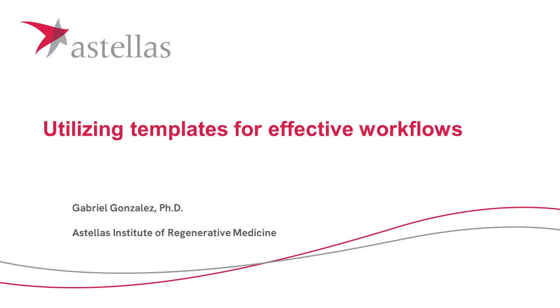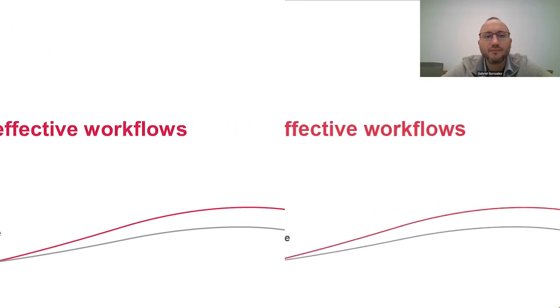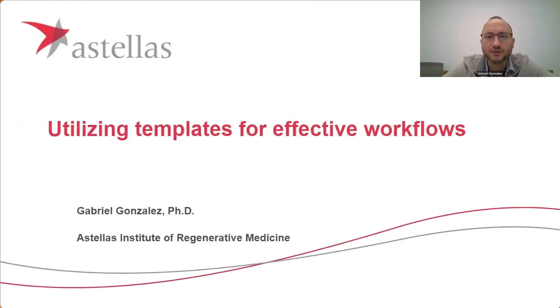Today I will be presenting how to utilize these templates for an effective workflow. So we went live with the, we call it a node, but with the ELN, with Signals ELN, back in May, and so far we've been utilizing it for creating these workflows that are really helping us with our work.